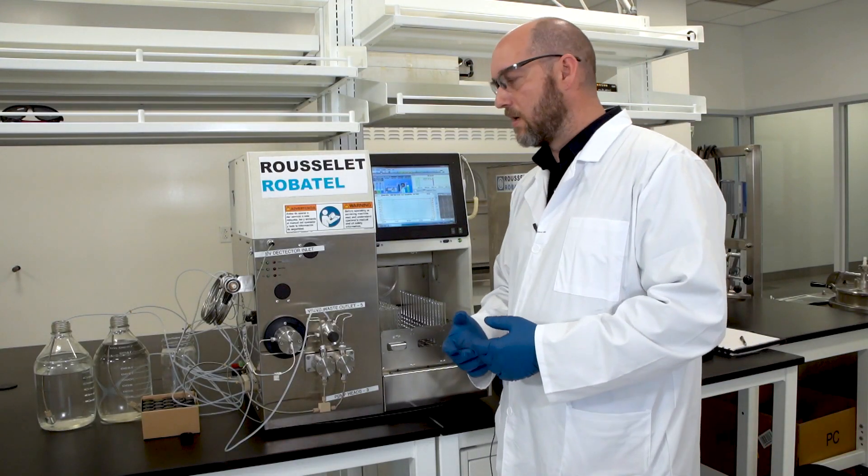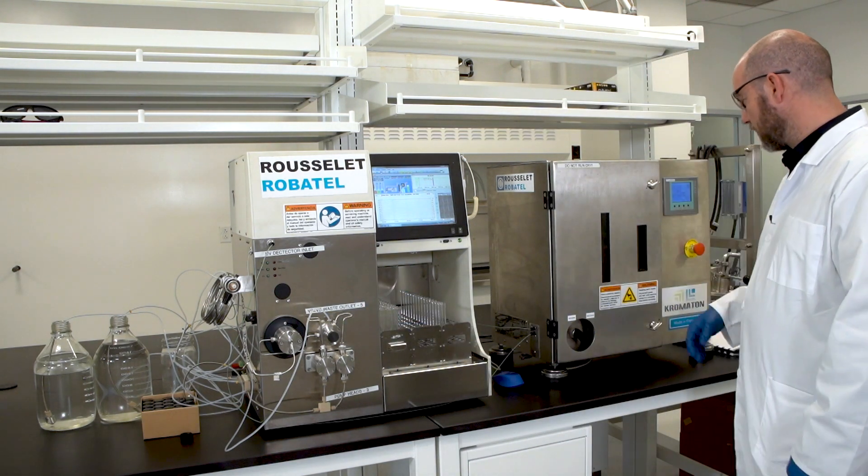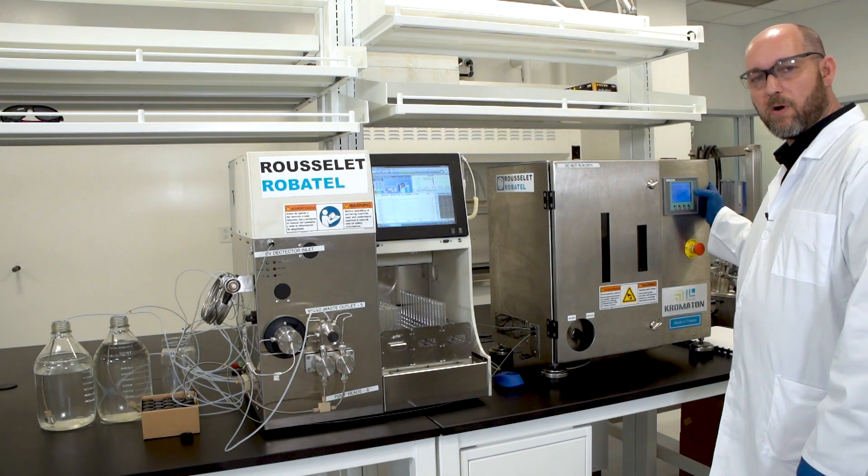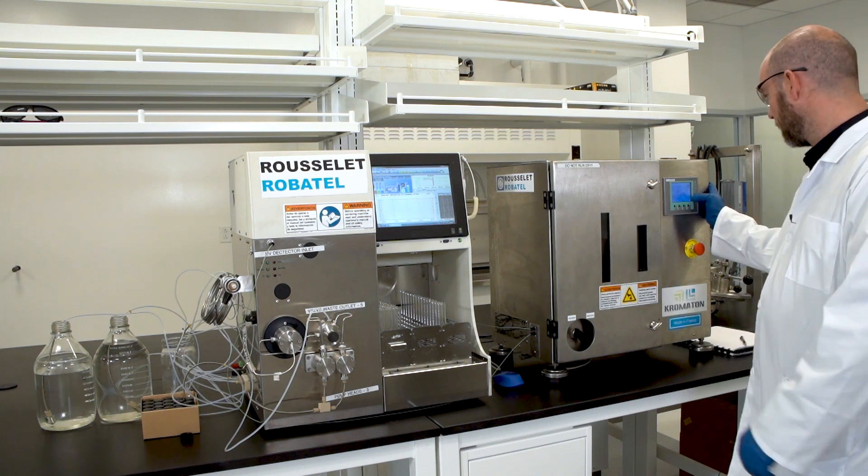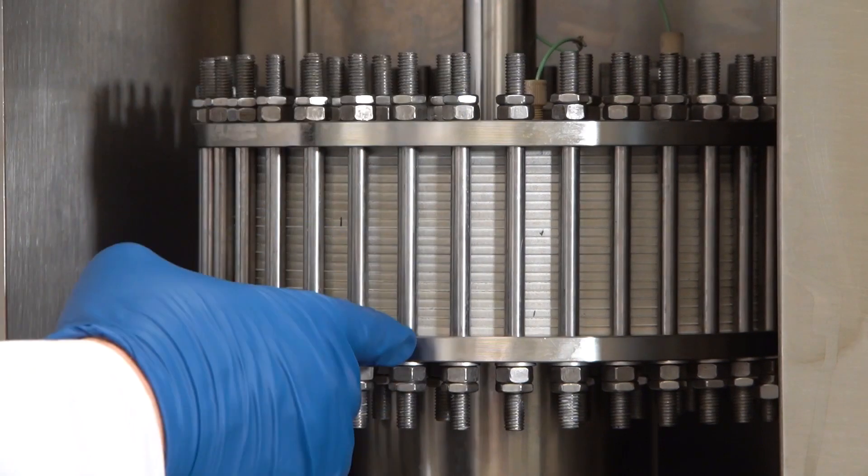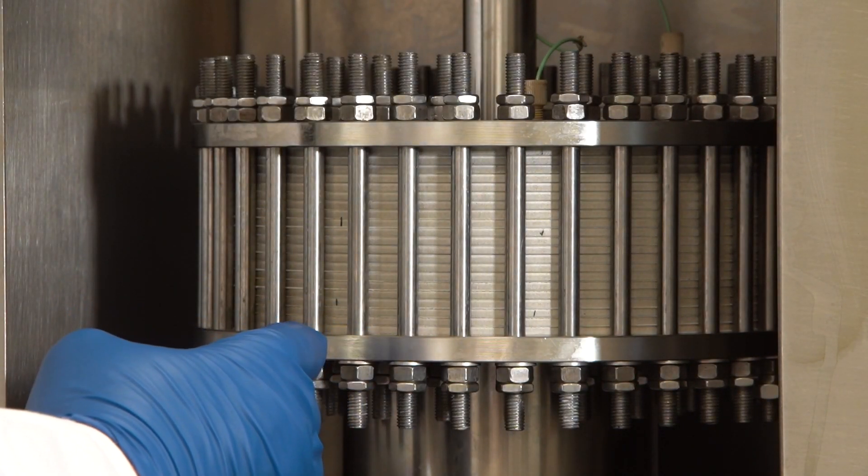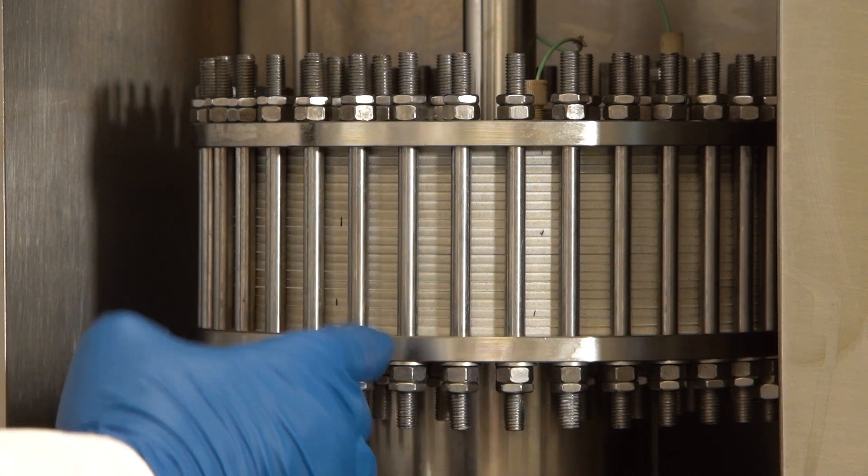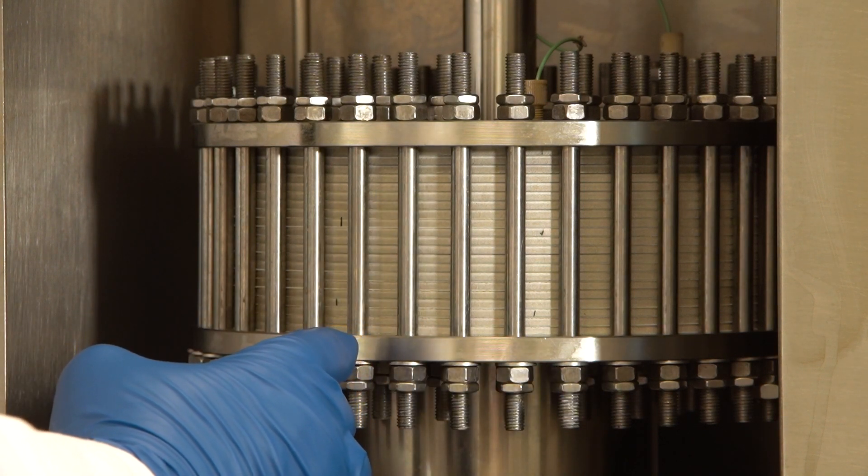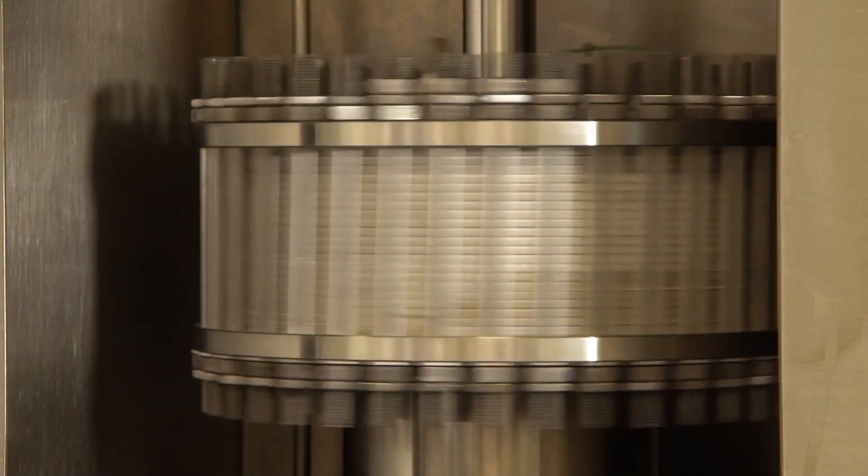After the injection happens, it's going to move through the pumps into the rotor. This is the centrifugal partition chromatograph rotor for a quick look. It has 840 doublets of cells inside, which essentially equates to 840 liquid-liquid separations in series with each other. It spins all the way up to a maximum of 1,500 RPM.